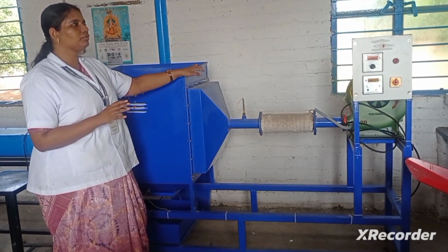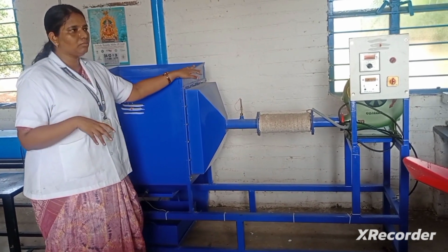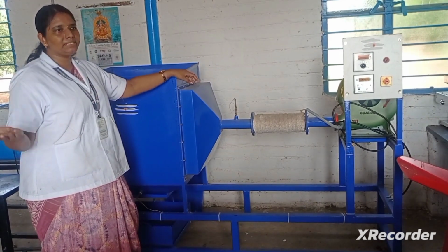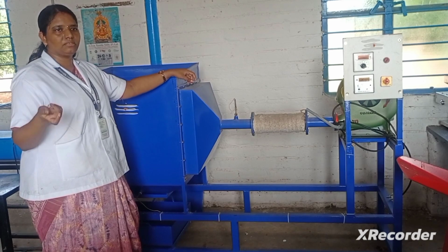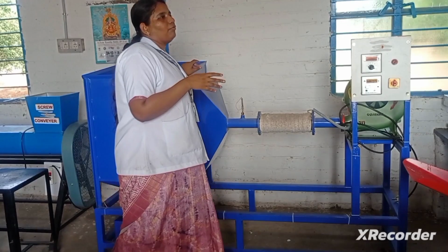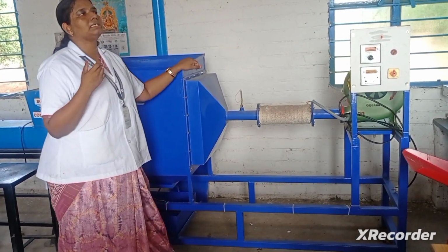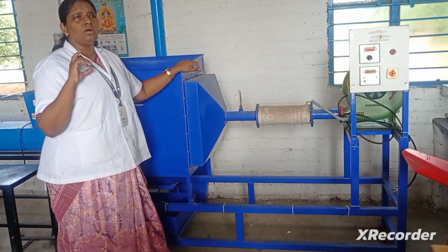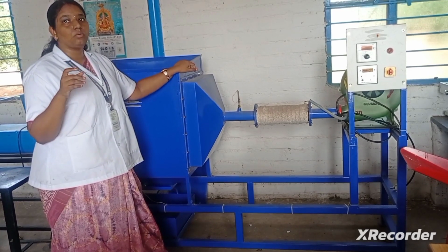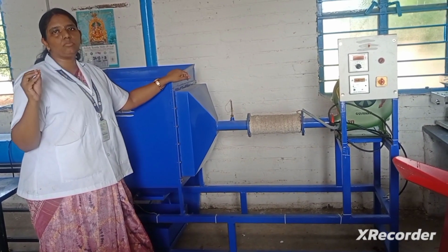For this experiment, we have to first start with measuring the initial moisture content. To measure the initial moisture content, we can either go directly by measuring with a digital meter, or we can go for a hot air oven. For that, we have to take 10 grams of the given sample. Then we have to place that 10 grams in the hot air oven for a time period of 1 hour at 130 degrees Celsius, or 103 degrees Celsius.